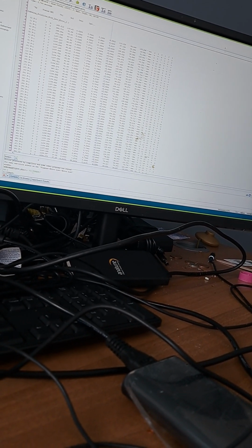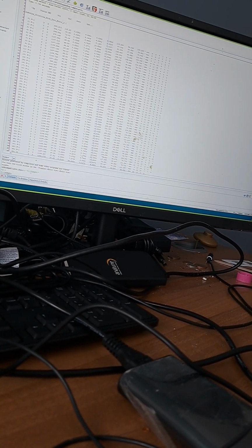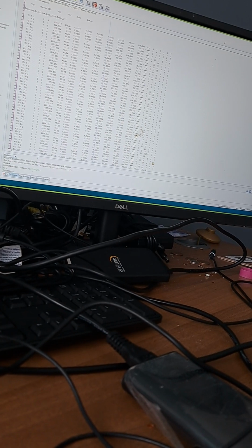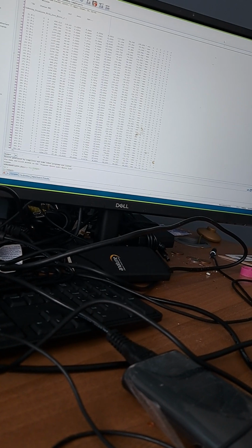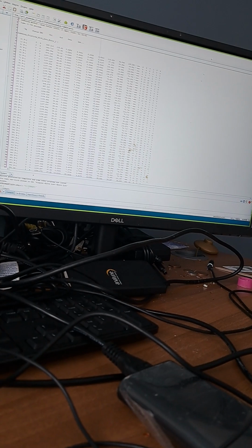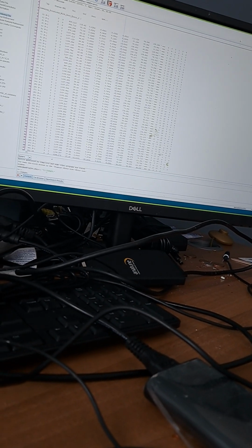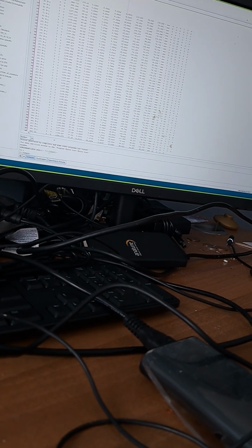So there's ones at 430 and 115. That looks okay. The unit cell seems to be a lot smaller, so you're going to have to divide that by 2. So that's 215 cubic angstroms. Yes. Per molecule or per unit. So is 215 ringing any bells? Is that miconazole by itself, or what is that? Shall I just quickly check the molecular mass of miconazole? It's not the mass, it's the number of non-hydrogen atoms. That's what you need. Yeah.